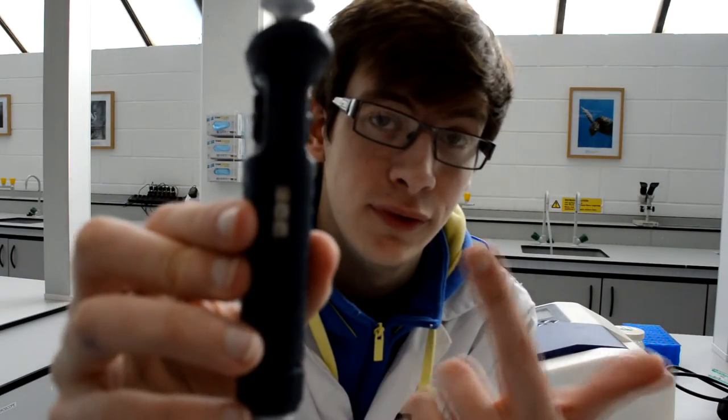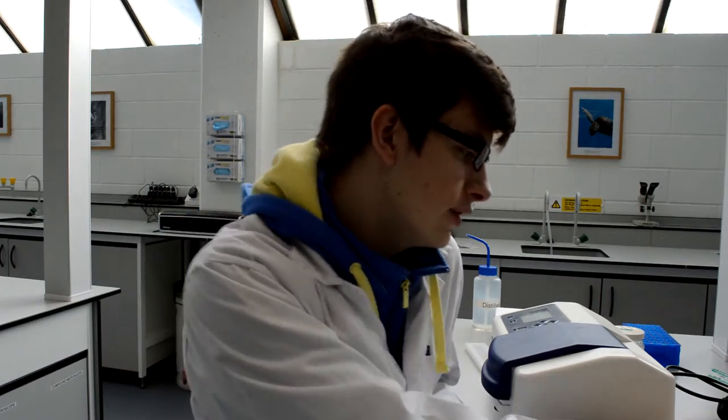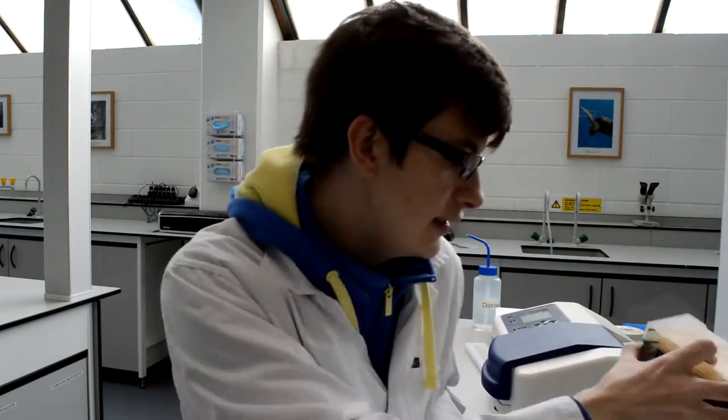So once you've adjusted to the accurate volume, for example, I've got 460 microliters on this P1000, you need to put an accurate tip onto the end, otherwise you're going to end up damaging the pipette. Depending on the size of the pipette, you're going to want to use a different size of tip. For example, for the P20, you've got the tiny little ones in the red box. For the P200, the yellow box here, it's sort of a mediumish size. And for the P1000, you've got the big blue one here.